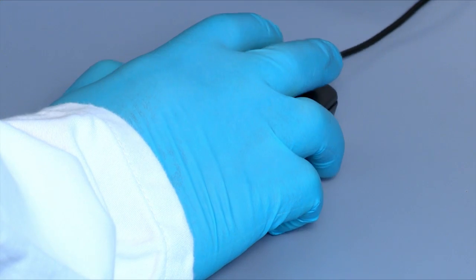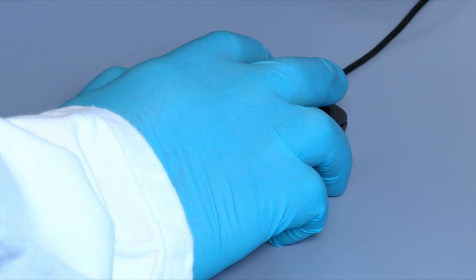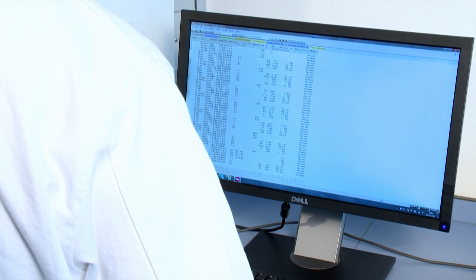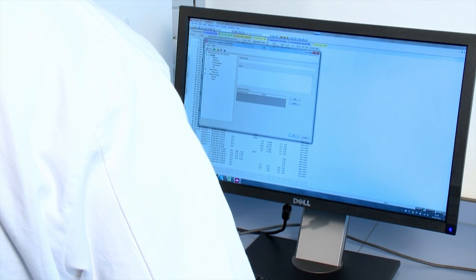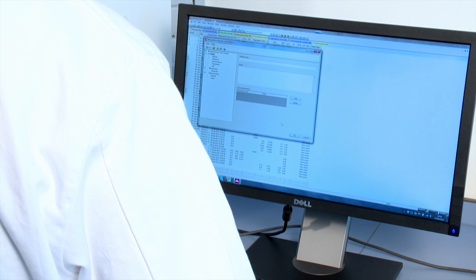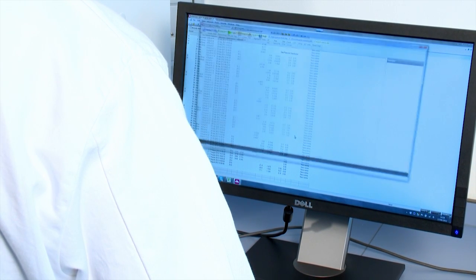The high sensitivity of Zetacizer Nano ZSP allows measurements of protein mobility at concentrations as low as 1 mg per ml, and as little as 20 microliters of sample is required. This video will show you how easy it is.